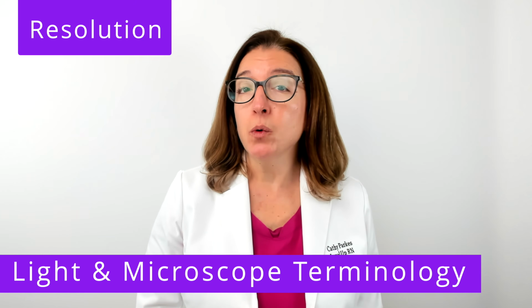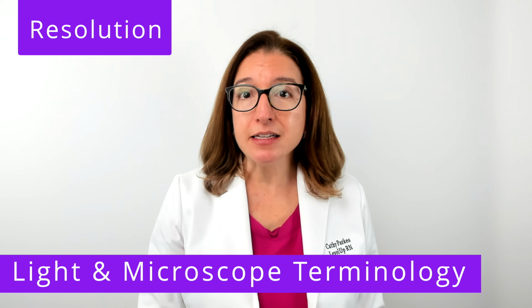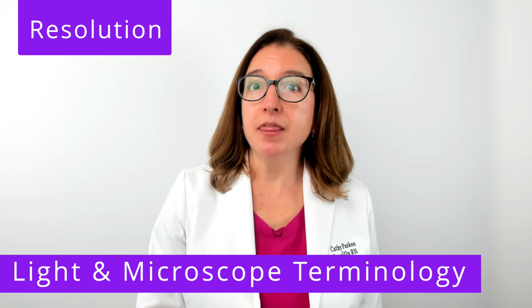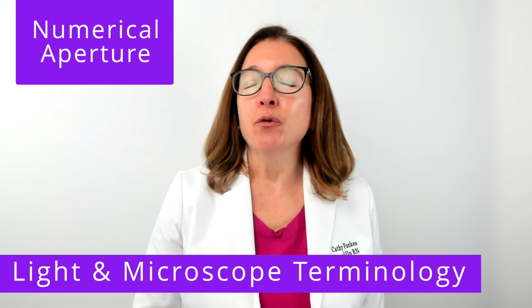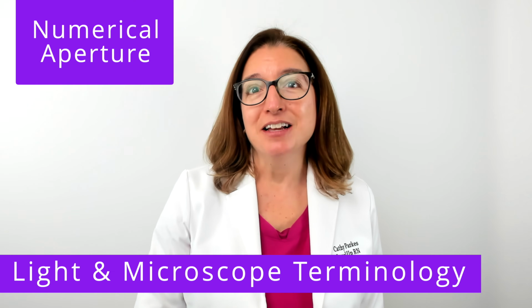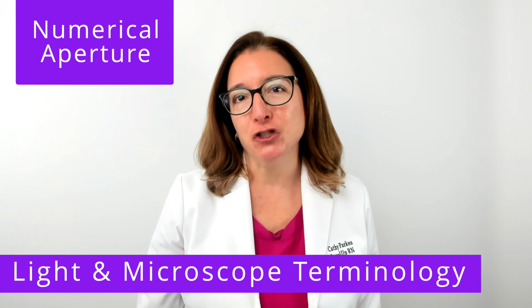So resolution is going to be better with a microscope that uses shorter wavelengths, such as an electron microscope, and with a microscope that uses a lens with a higher numerical aperture. So numerical aperture refers to how well a lens is able to gather light. So the higher the numerical aperture, the better the resolution.